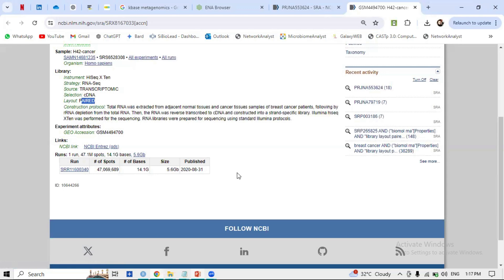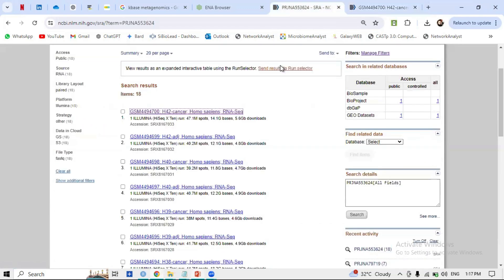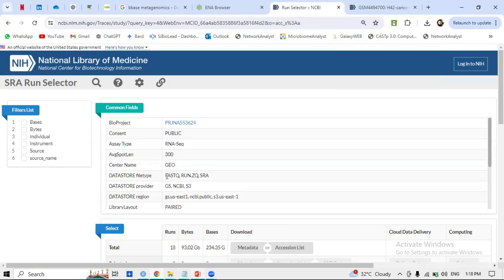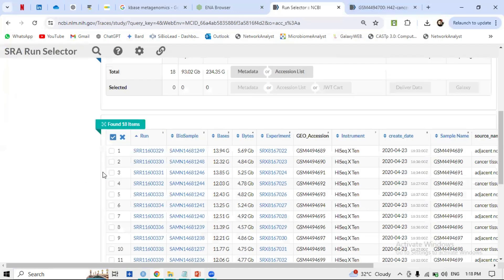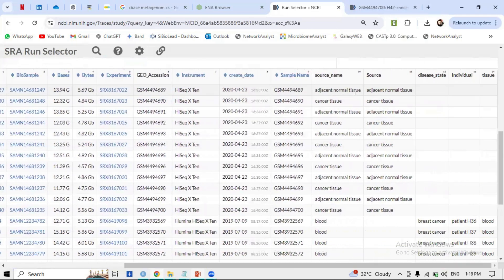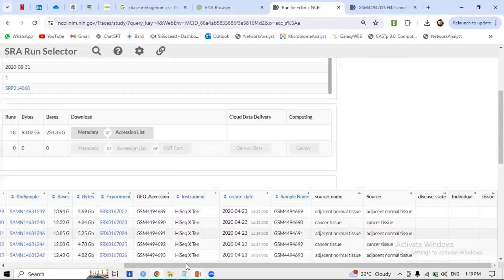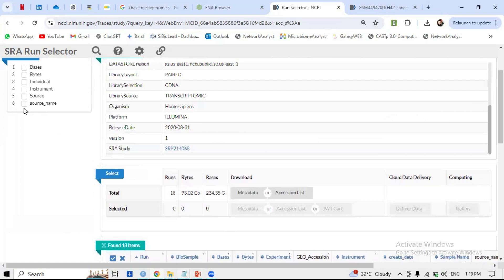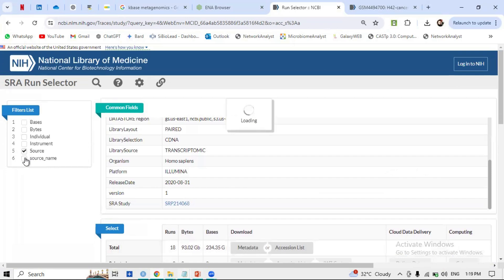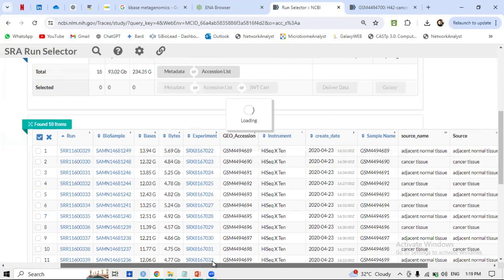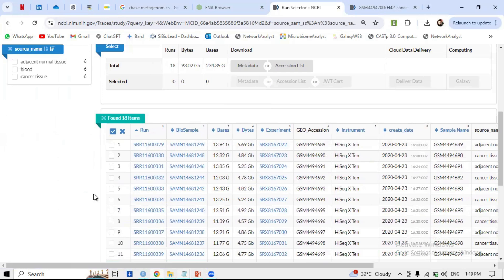To find out whether a sample is related to breast cancer or normal tissue, send it to the SRA Run Selector. The results confirm it is RNA-seq with paired files. Looking at the metadata: you can see normal tissue and cancer tissue. The source names include adjacent normal tissue and cancer tissue — a complete study design that you can explore and download.